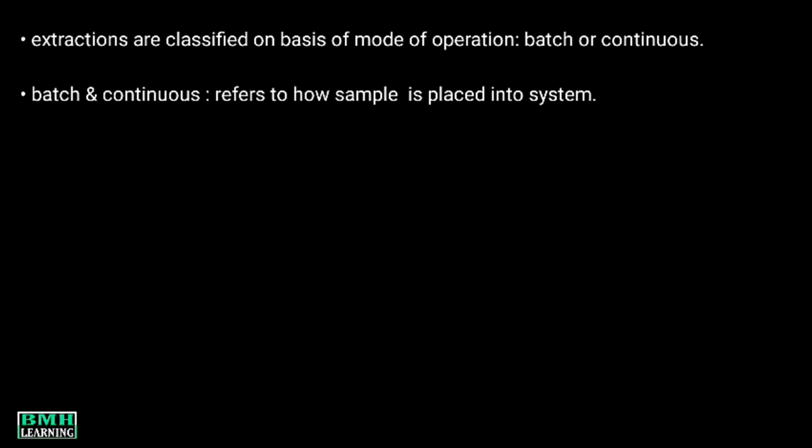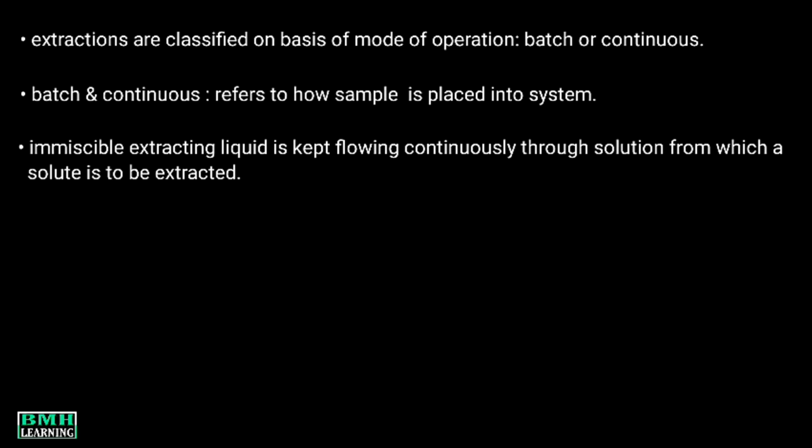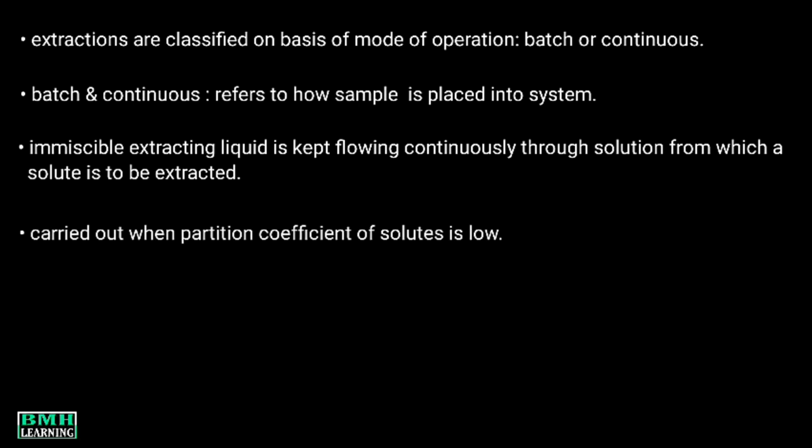In continuous mode of extraction, an immiscible extracting liquid is kept flowing continuously through the solution from which a solute is to be extracted. This kind of extraction is carried out when the partition coefficient of the solute is low.